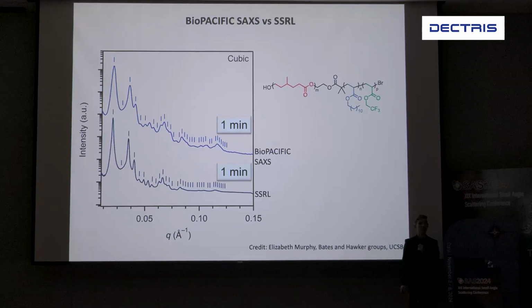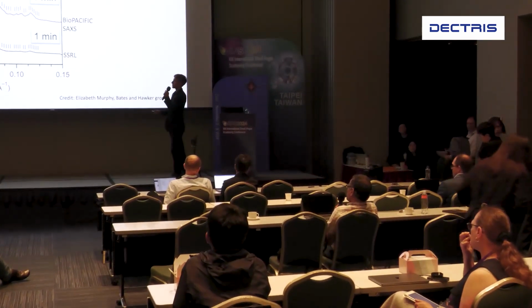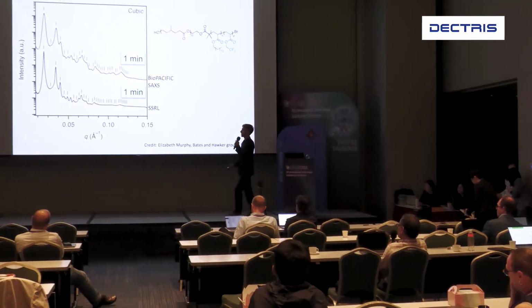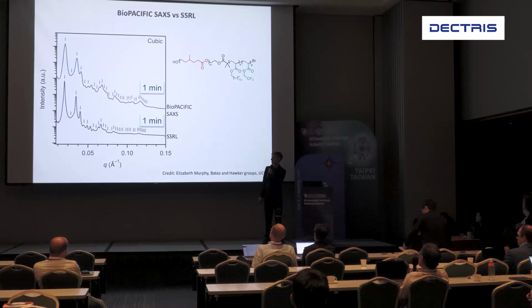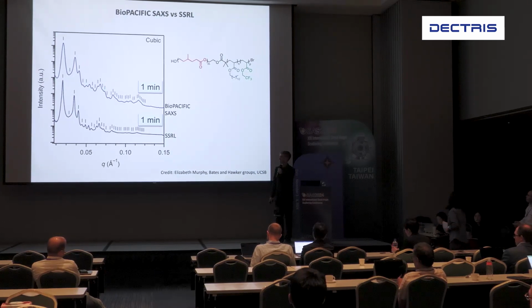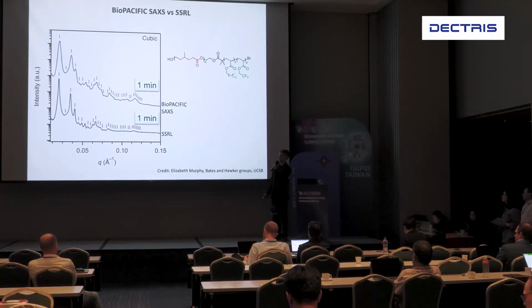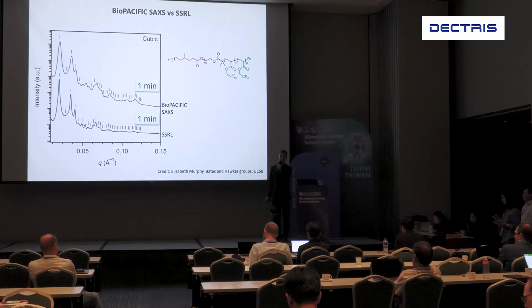But you don't think that you exposed too long and destroyed your sample at the synchrotron? It could be that, but unfortunately I don't know. The user ran it, but I trust their work. No, this is raw data. This is not background subtracted. If you look at this peak, you can clearly see that it gets definitely stronger. The flat background. Oh yeah, I get it. I see what you're saying. The solvent may not be the same. Then it wasn't solution scattering, but okay. Sorry about that. I think it's just degradation. It could be due to very long exposure times. I can agree with that, but it could also just be that the sample aged over time.